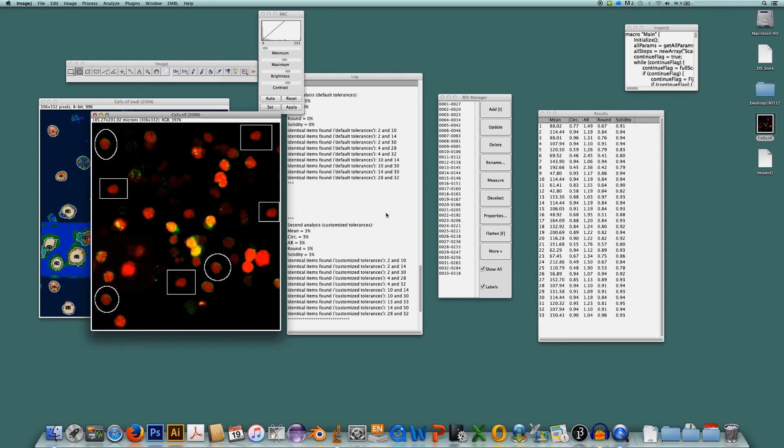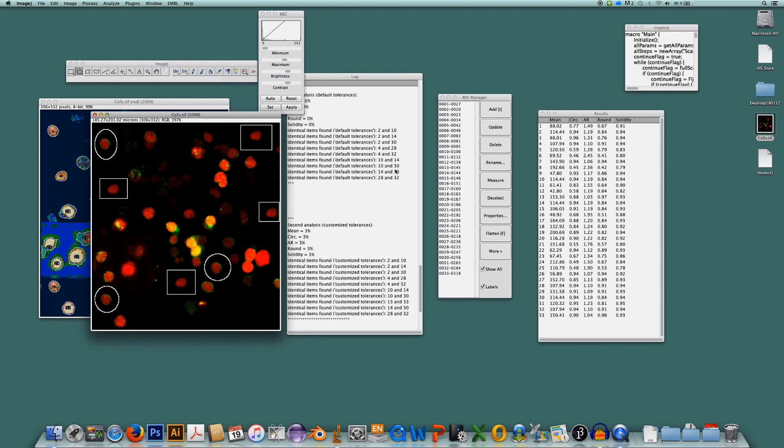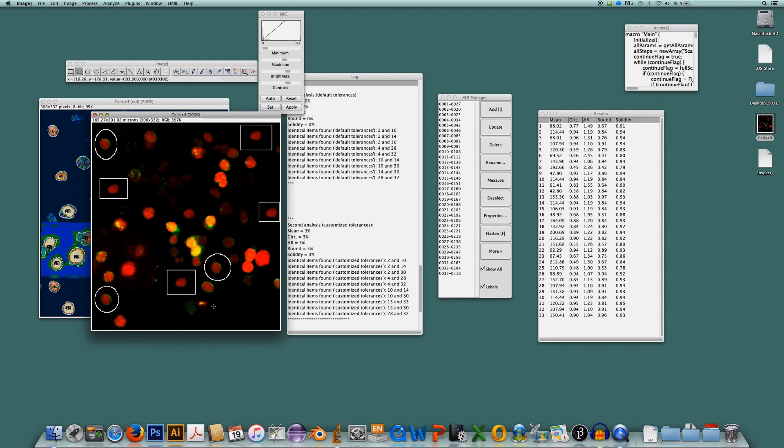In case you wonder what's going on with these numbers, it's not only 2 is identical to 10, 2 to 14 and 2 to 30. No, it's also that 14 of course is identical to 30 and 10 is identical to 14. That's why the list is a little bit longer. But these are the groups of identical items.